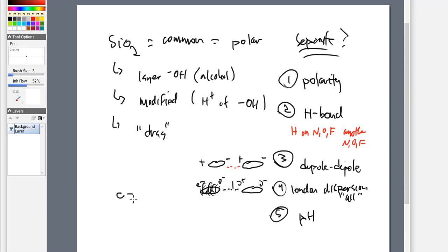So this carbon is going to be involved in a carboxylic acid group, and it's also involved in an amino group. And in acidic conditions, we are going to see that that amine group, which is normally NH2, is going to be protonated because it is a base and it loves some hydrogen whenever it can get its hands on it. So under a certain pH level, this is kind of what goes on, and the pHs that we have, whether it's 2 or 7 or 10, can start affecting the way that this molecule is going to be operating.